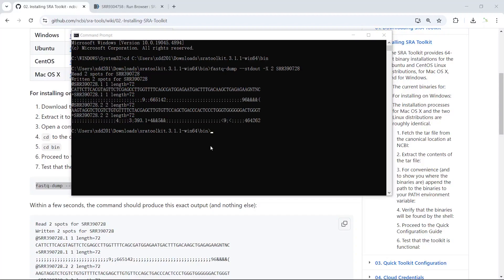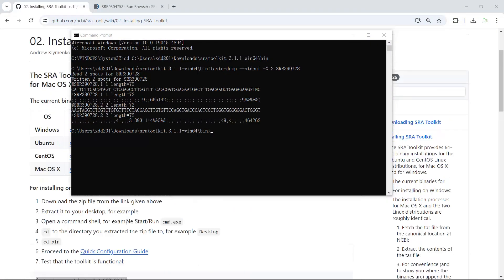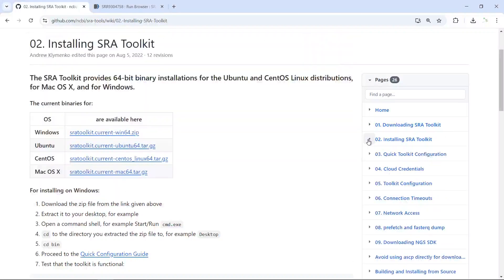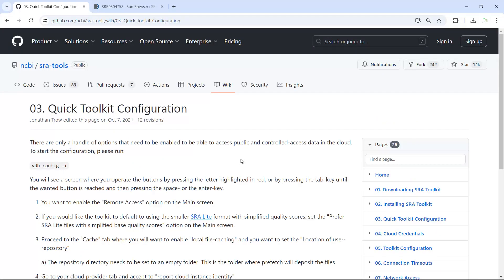Actually, you don't need to change anything here. You can use the default settings to download the raw sequencing data from NCBI. But for more advanced usage, you can run the quick toolkit configuration. Looking at the configuration guidance, the first option is cloud credentials — covering how to use Amazon and Google cloud computers.